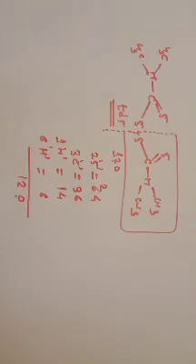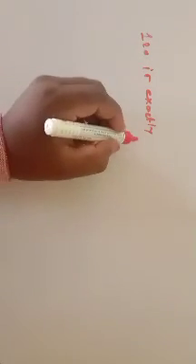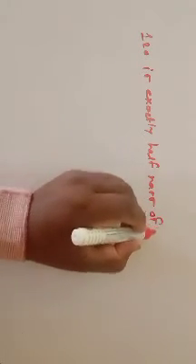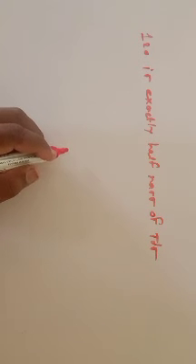So half of the TDS is present in your product. So what does the remaining mass indicate? The half fragment of this TDS is present in the complex. Okay, so we can write here, 120 is exactly half mass of TDS.